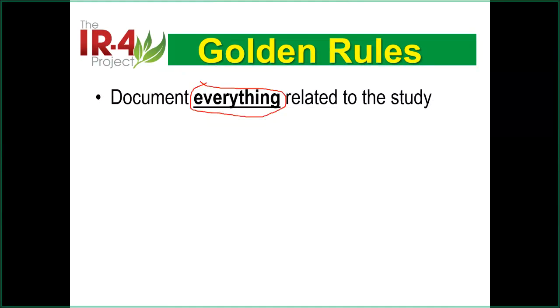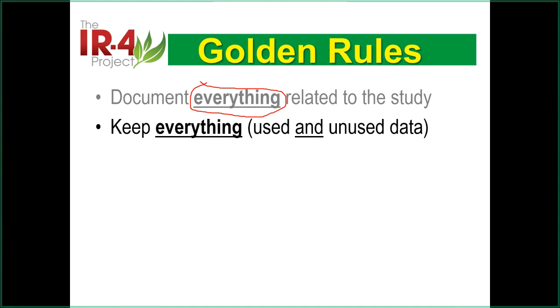You not only document them, you need to keep them. A lot of times you write something on your glove, do a quick calculation, you need to cut and paste that glove onto your raw data. You keep it, even though it's unused data. Say the QC is 68% recovery because the instrument is leaking, it's not that good, the retention time is shifting. Say it's unused data. It is called unused for this purpose, but you are using it for the GLP purpose. You have to keep that.